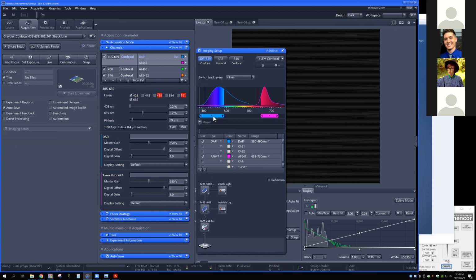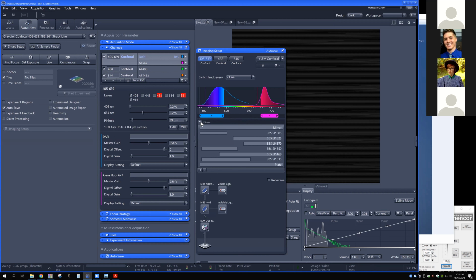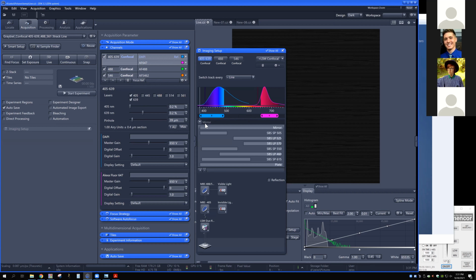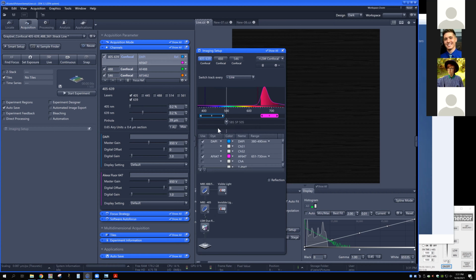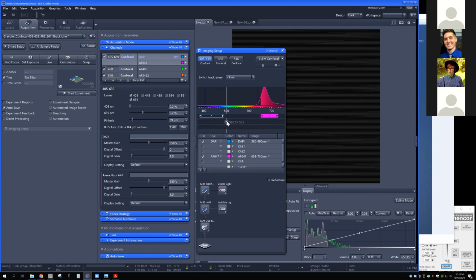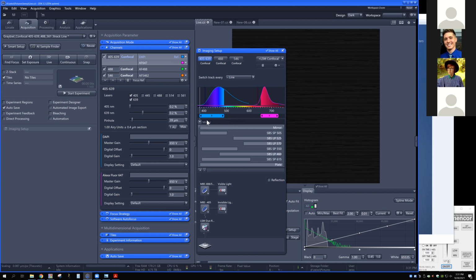So what I wanted to show you was these little slider bars that we have here. Those don't exist for the Airyscan, so you don't get to see this part of the hardware cartoon. But I never mentioned, sneakily, that underneath this you actually have 2 other rows as well, these little dark gray rows. One of them is for the mirror, and this is actually our first pass here. And if I change this, you'll see that it actually uncovers this other one that you have here as well. Well, it should anyway. So this is that first gate that we were talking about earlier. All right.